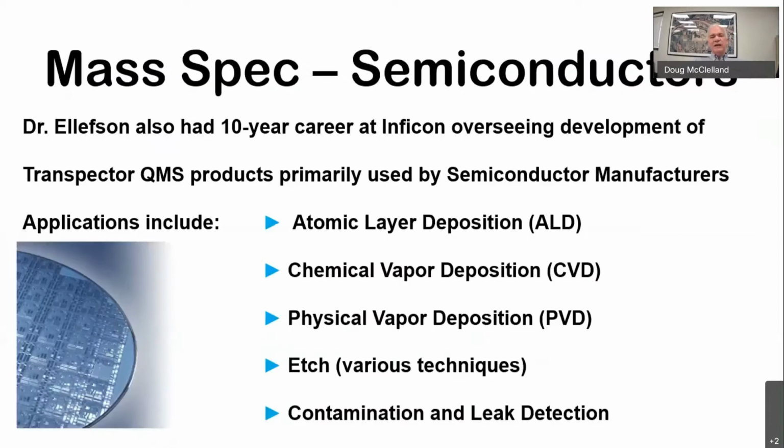Now, in general, Dr. Ellefson, I might note, when he retired from Mound, spent 10 years with INFICON, manufacturer of mass specs, and his group was responsible for producing the Transpector QMS, which you'll see demonstrated in this presentation.